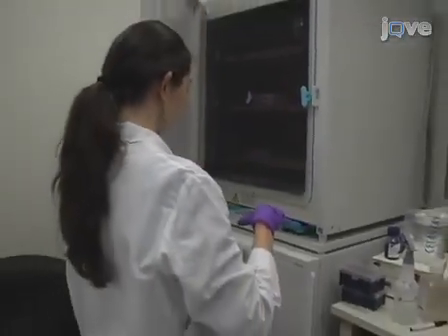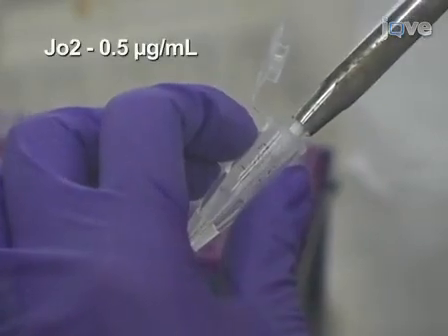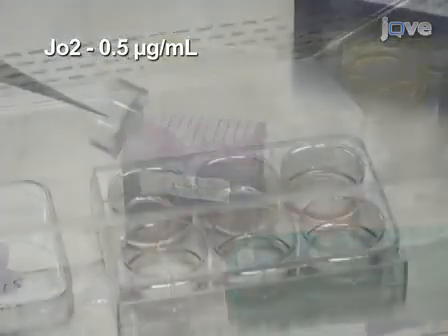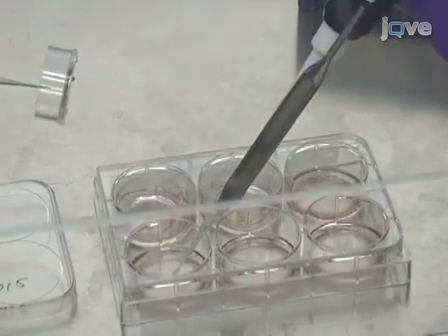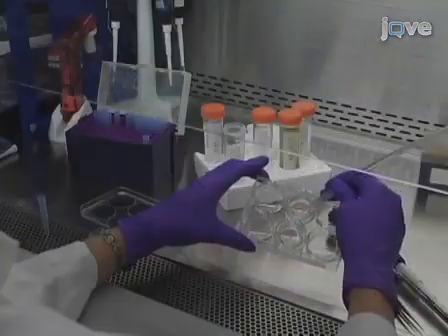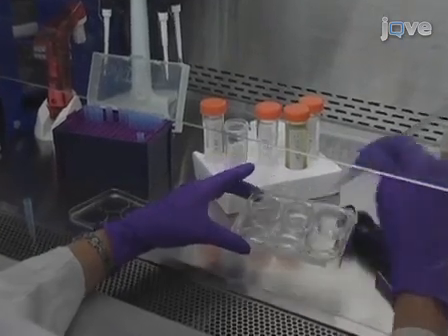The apoptotic challenge is performed after 5 days of culture. Add the Fas agonistic antibody Jo2 to the cell culture media in the wells to be treated. Leave half of the wells untreated as controls. Once 24 hours have elapsed, aspirate the media from under the wells.